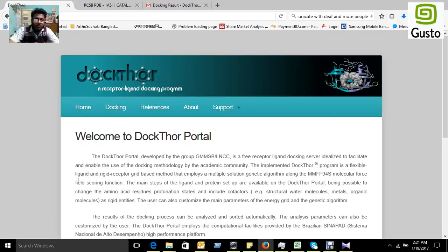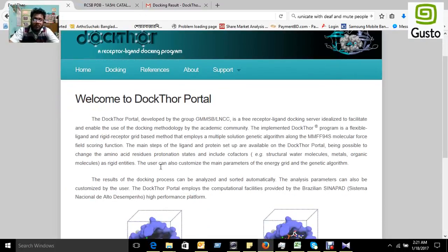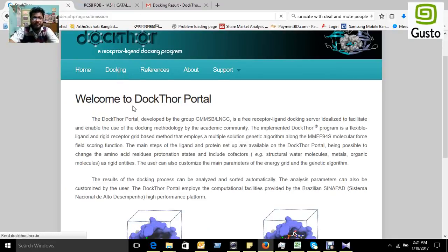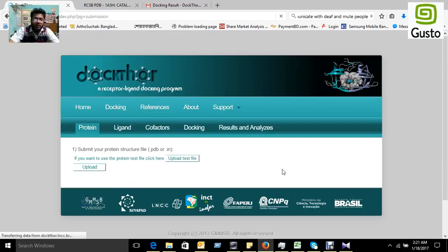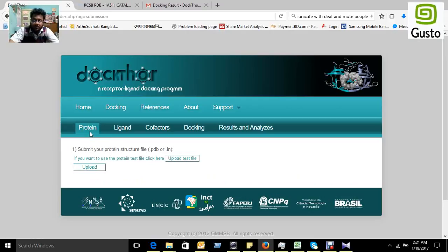We have a website of Dockthor portal. For docking purposes, we have to first go to Docking and press it. Then a page shows, and here you have to load a protein which must be in PDB format.